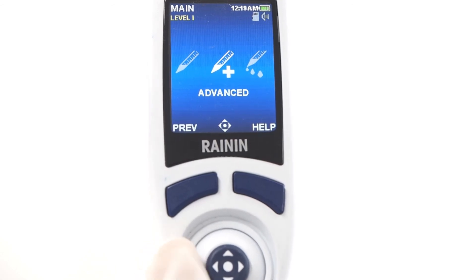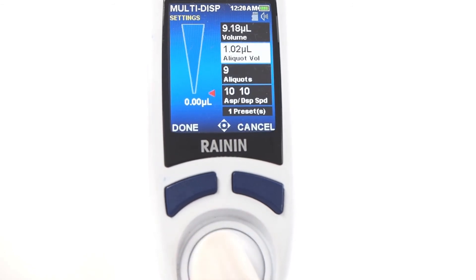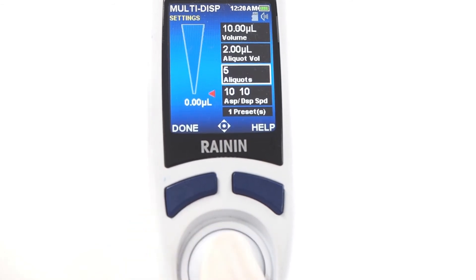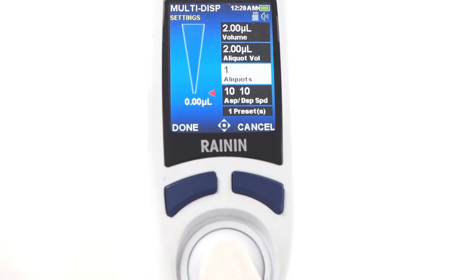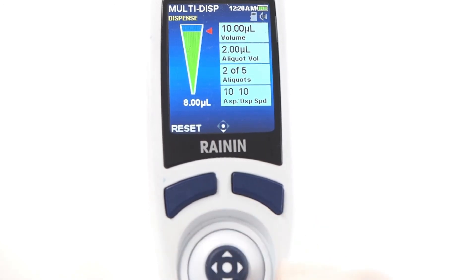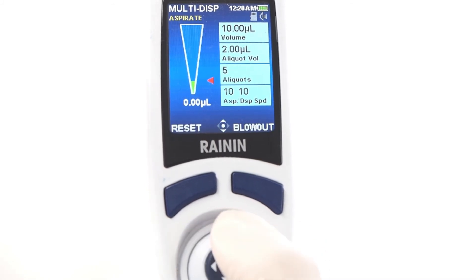One of the E4's most popular modes is multi-dispense. It's a time and effort saver when you need to fill a plate with multiple columns of reagent. Aspirate just once and dispense multiple aliquots from the same tips. On the E4, shifting aliquot volume can change the number of aliquots based on the initial volume set. With a 10 microliter volume setting, an aliquot volume of 2 microliters can only be pipetted five times. Shifting the number of aliquots can also shift the initial aspiration volume. To manually multi-dispense, tap the joystick up to aspirate, tap down to dispense each aliquot, and blow out when done.